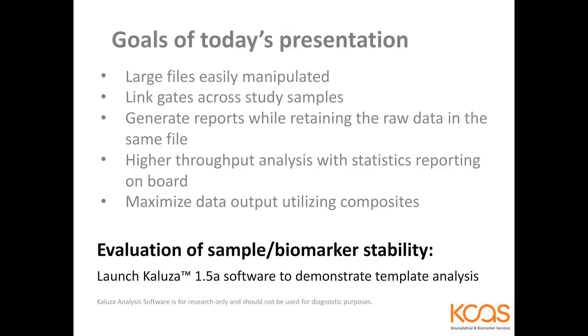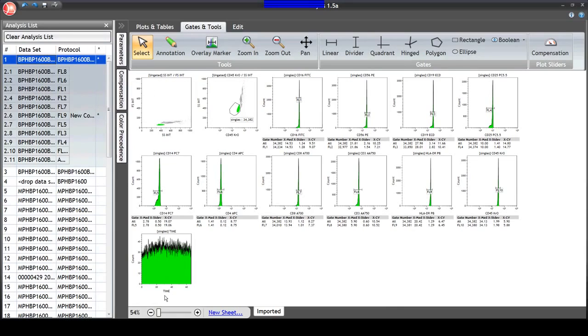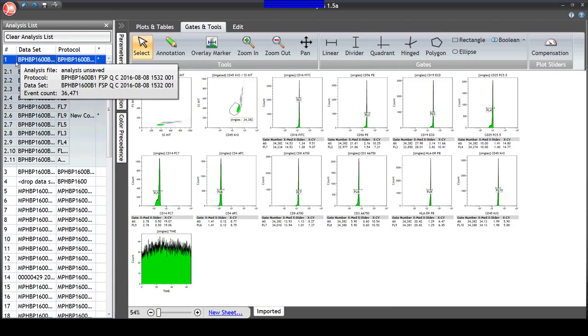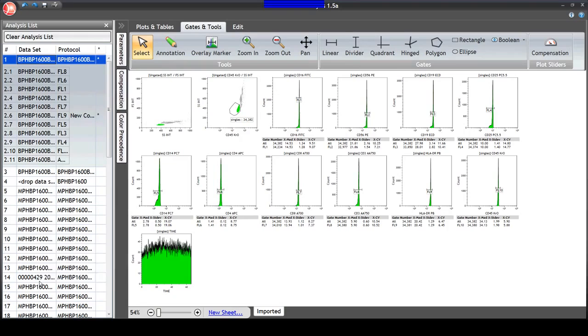Right, so without any further ado, if you'll give me just a moment, I am going to start sharing my desktop so we can jump into the software. All right, so hopefully you will see a screen in front of you that has dot plots and histograms. And as I am no longer looking at the window that gives me feedback, I'm going to assume this is the case.